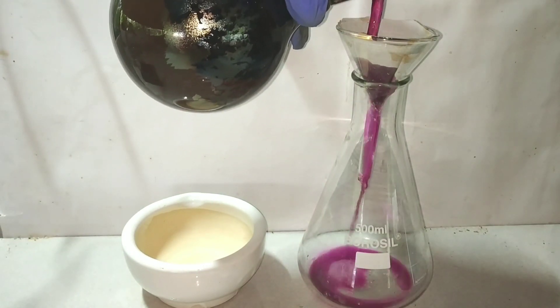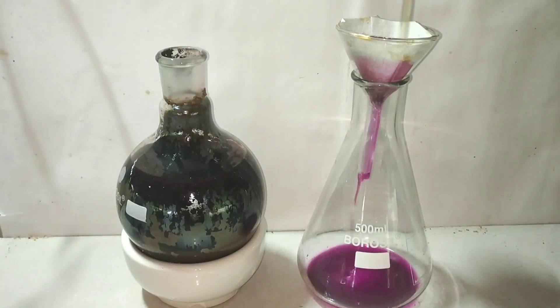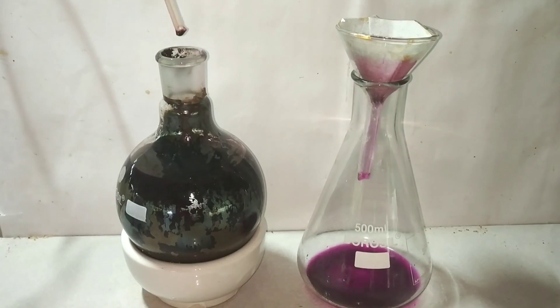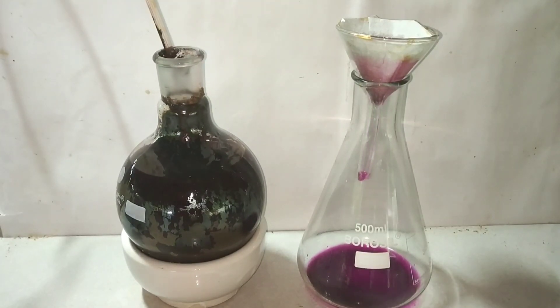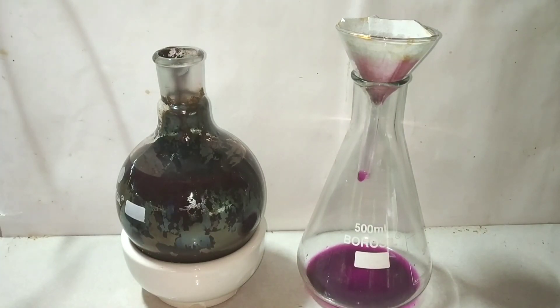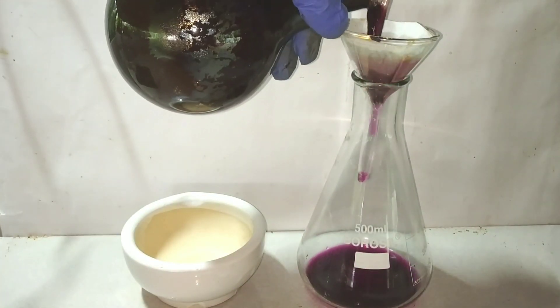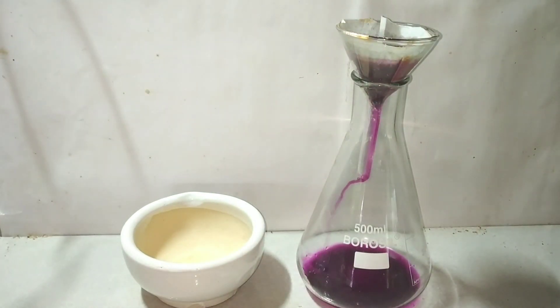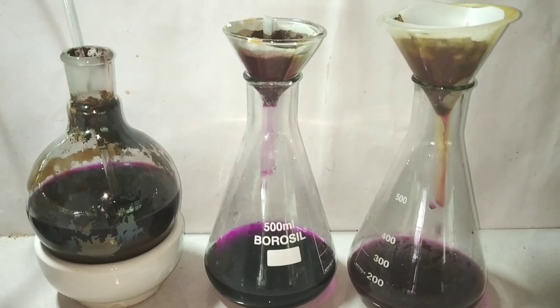After that we allow it to cool and start filtering the solution. I am using a gravity filtration method here because I do not have the vacuum filtration setup — if you have that, use it because it will be much faster. Filtration removes the manganese dioxide and other suspended particles. The filtration turned out slow, so I had to take another Erlenmeyer flask to set up filtration.